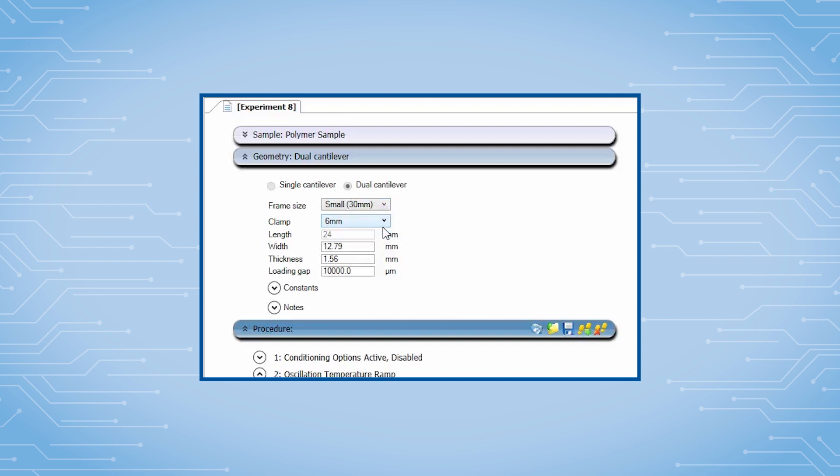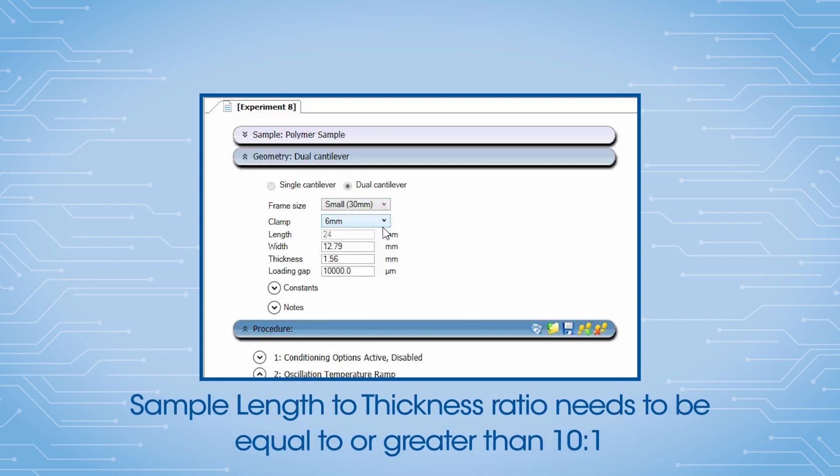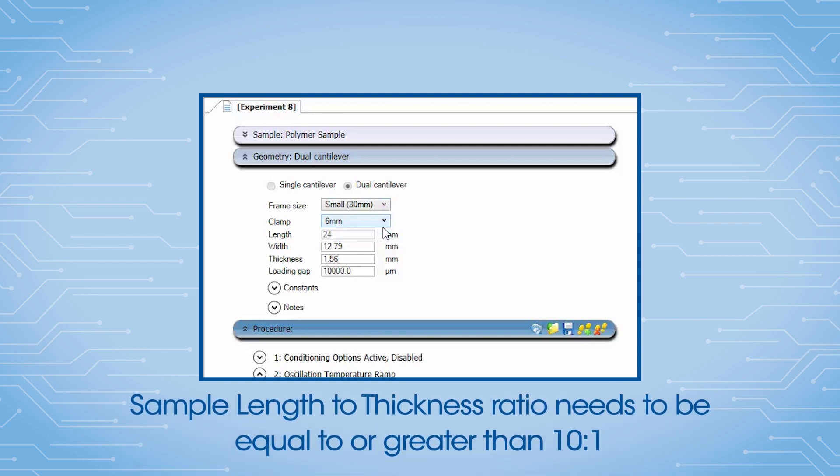To ensure an accurate bending test, the sample length to thickness ratio needs to be equal to or greater than 10 to 1.